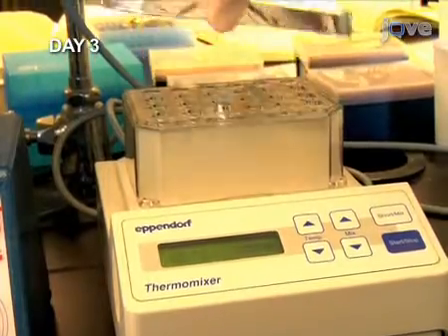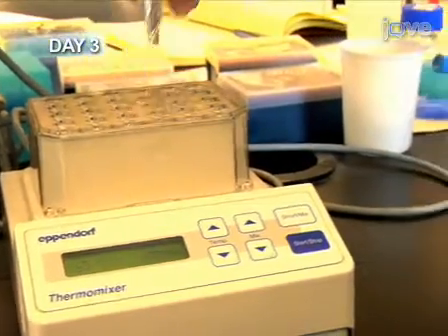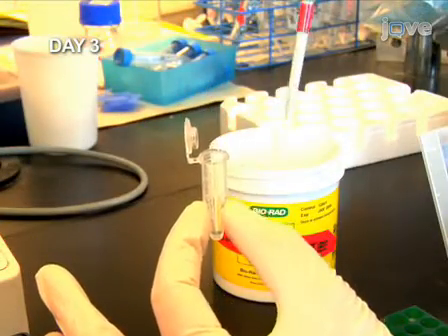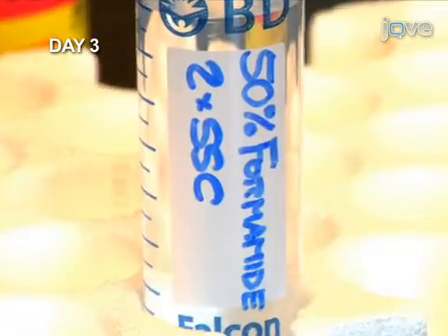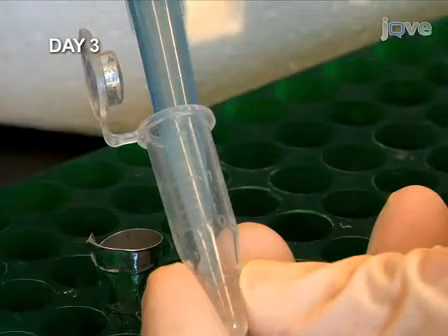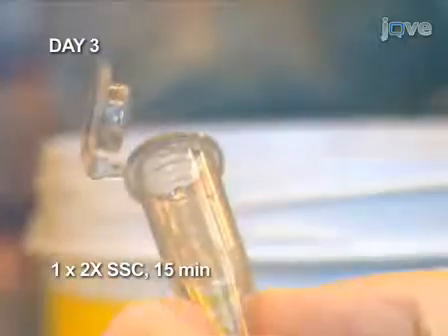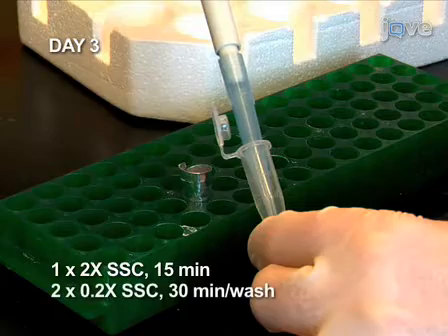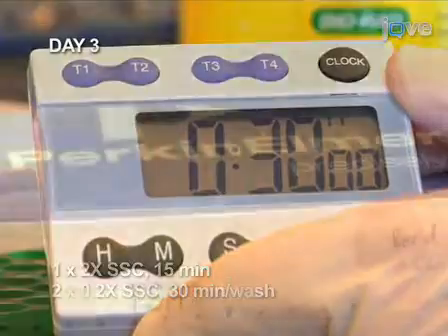The hybridization is done, so let's remove the excess probes. From now on, detergent is eliminated in order to improve the staining; however, note that the embryos become sticky in the absence of detergent. Wash twice with 50% formamide 2x SSC solution for 30 minutes each time. Wash once in 2x SSC solution for 15 minutes. Finally, wash twice with 0.2x SSC for 30 minutes each time. Next, we will visualize each probe.